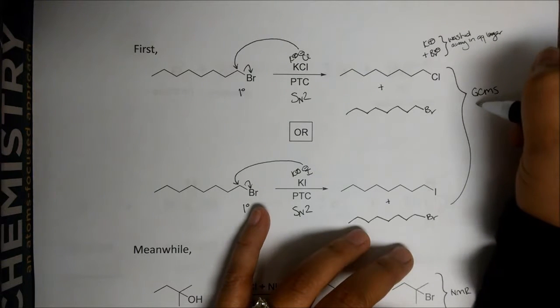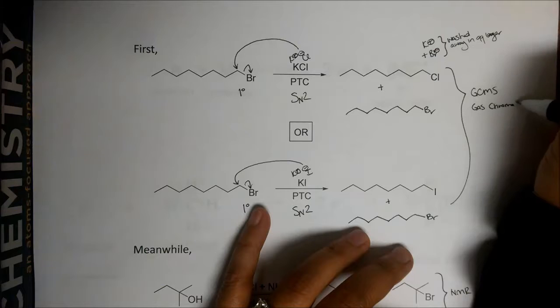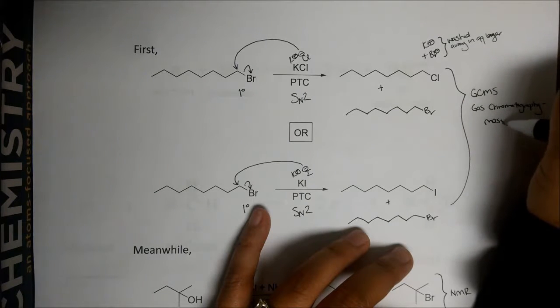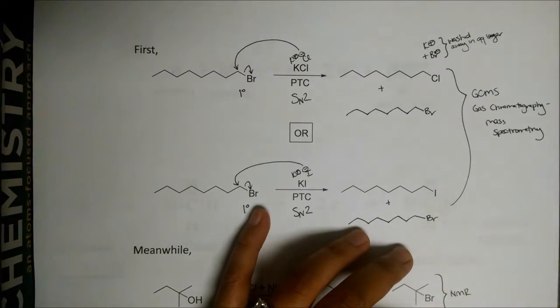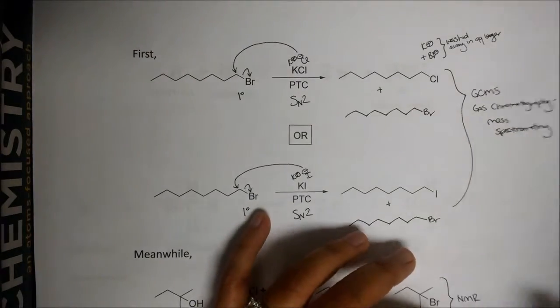Again, we subjected this to GCMS, so we have to learn about GCMS. GCMS stands for gas chromatography mass spectrometry. So we have to learn about the GCMS first. First up, the mass spec part.